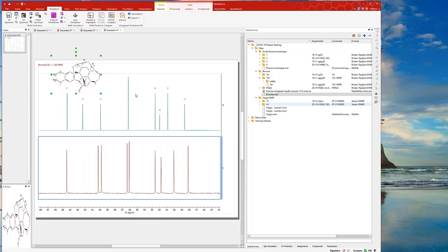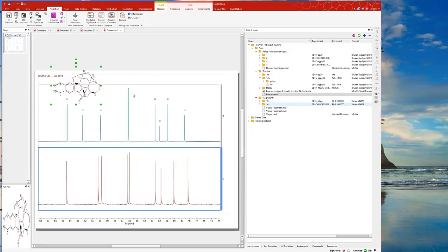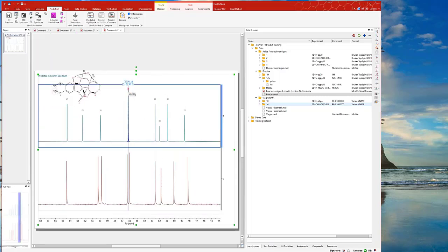Okay, the predictions are quite different. Here, this should be 6 and 3. Yeah, they're also different. They're getting almost together. So this will make it hard for us to do assignment, right? And there's some other regions as well, right?